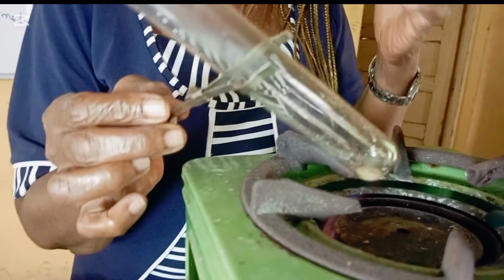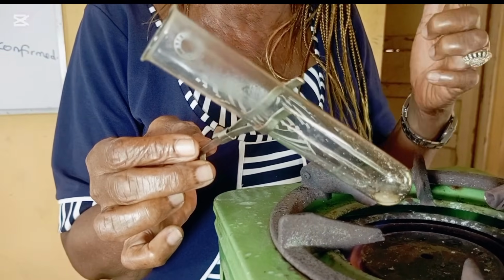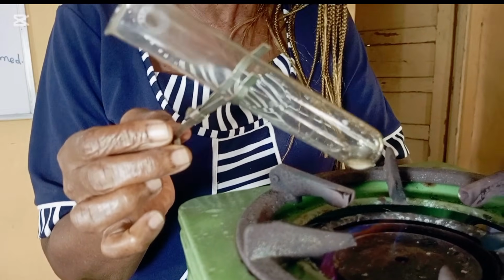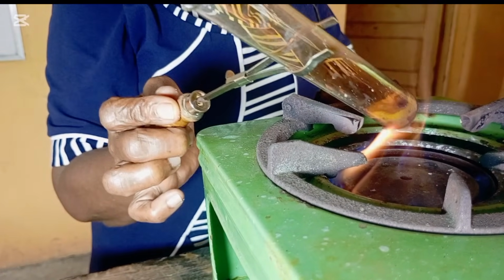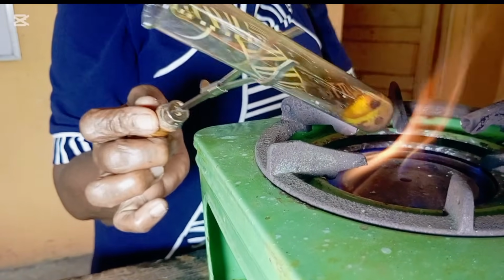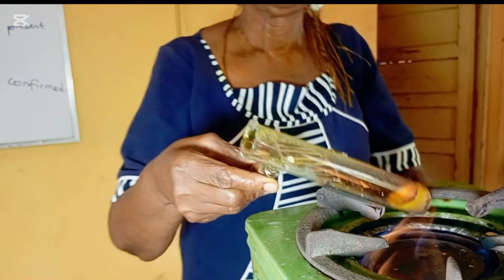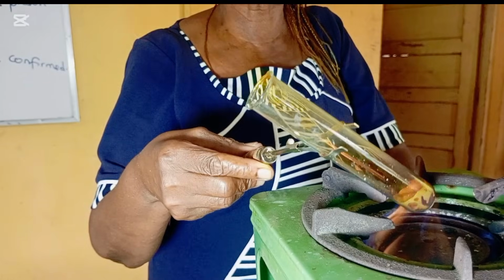Now here, you can observe the crackling sound. It's very important. I'm heating it directly and I'm observing that crackling sound. From there it will melt. You can observe the sound. That's the gas, that is NO2 gas. That's the color. You perceive it, it has a pungent smell. You can see it. That's just what we want you to see.